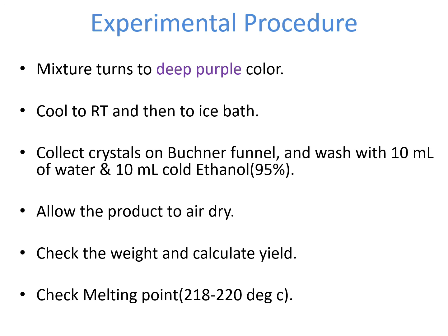And we will be calculating the percentage yield for our experiment, and to do that we will need an actual yield from this experiment and a theoretical yield from the reaction, and that's why we need to weigh the product at the end of the experiment.